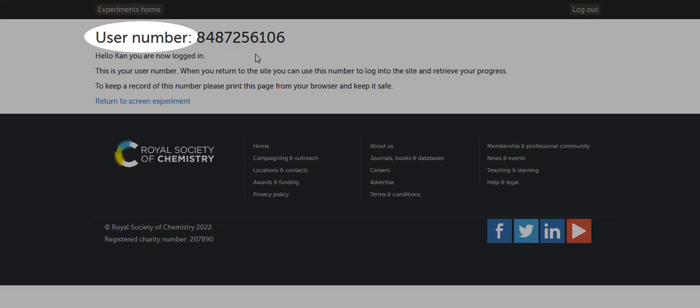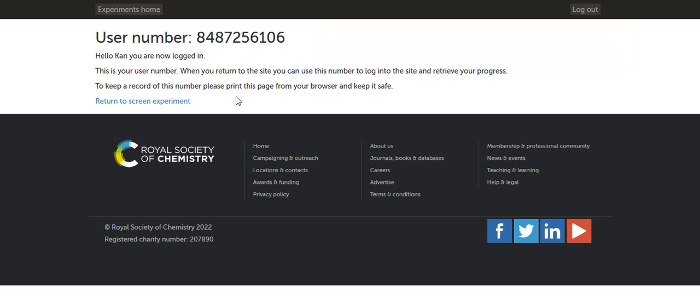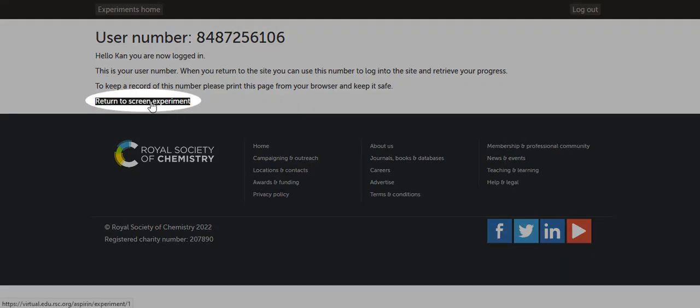This is the user's number. Write this number down and save it. In case your browser crashes or you want to complete the virtual lab at a later time, you can use this number to log back in and save your progress. Now click this link to return to the screen experiment.